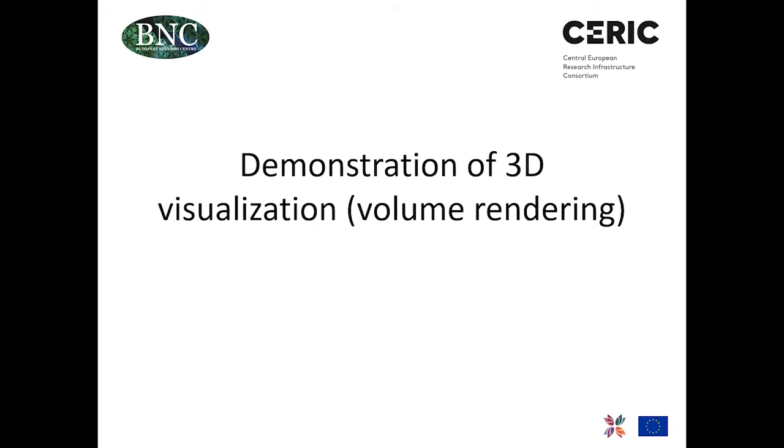So then we can proceed with the second part of the demonstration, which is volume rendering.